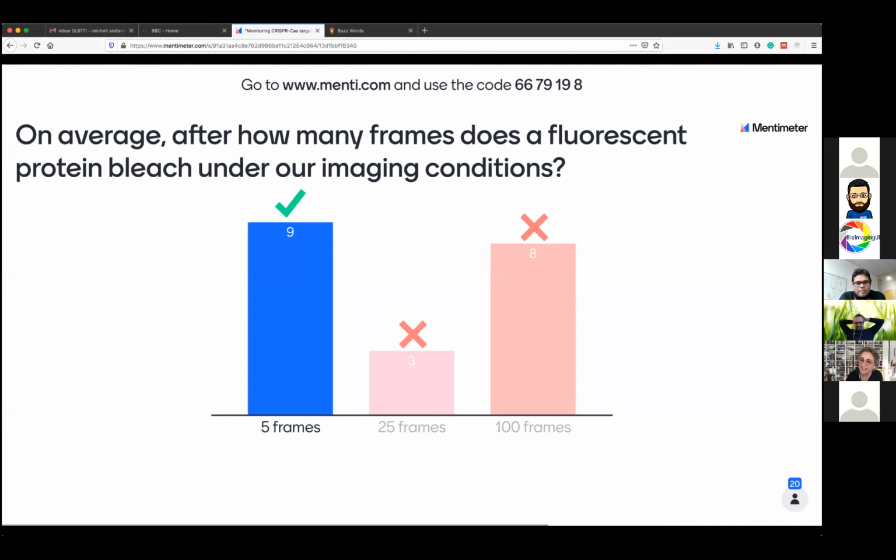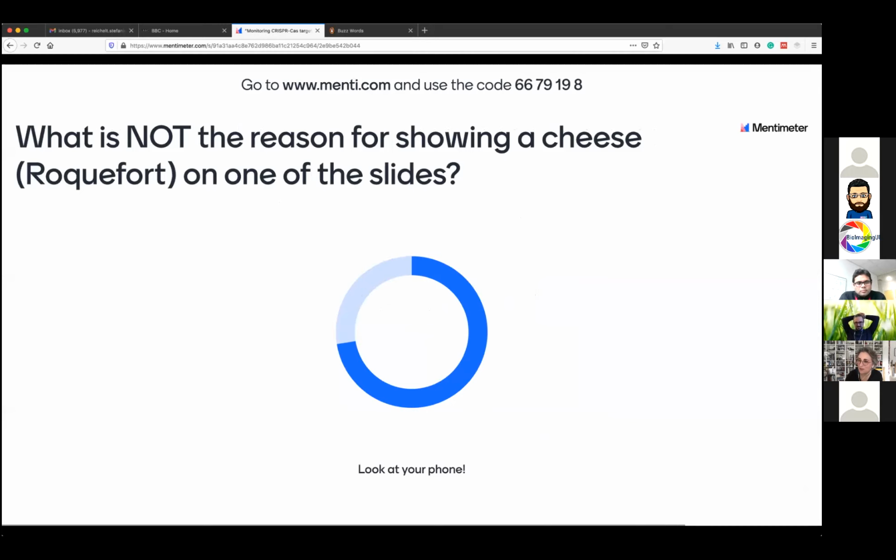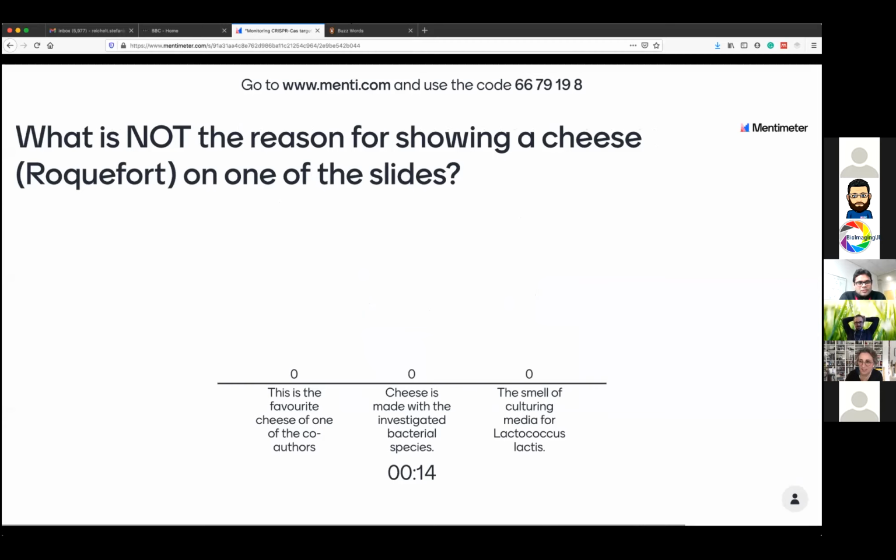So, and it's also the challenge for any microscopist making systems. You sometimes make a microscope, and then you hold a sample into it and within less than 1 second it's actually all disappeared. So this is quite nice.